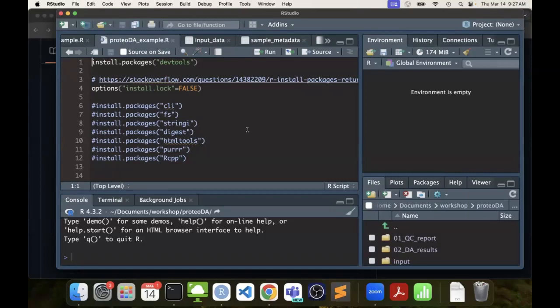So in the script Dennis shared with everybody, there's some extra. Let me start up RStudio. Anybody seen RStudio? Okay, we've got a few that haven't. The way it works is there are different windows. At the bottom, I am in a directory, and this shows me all the files where my files are in the directory.